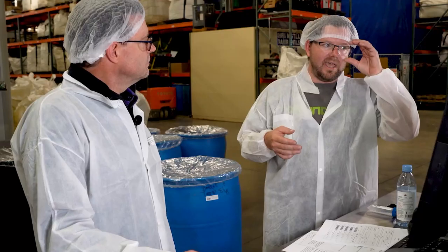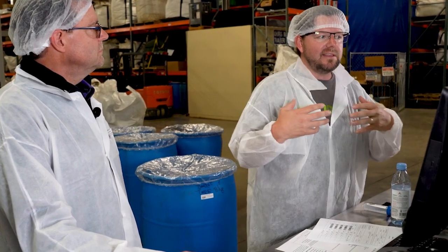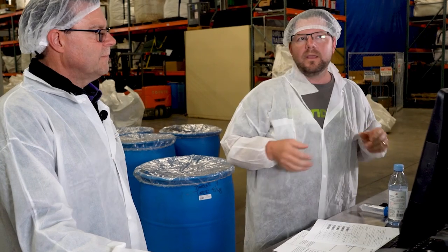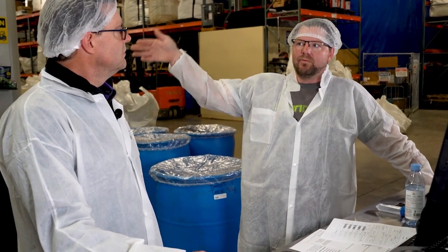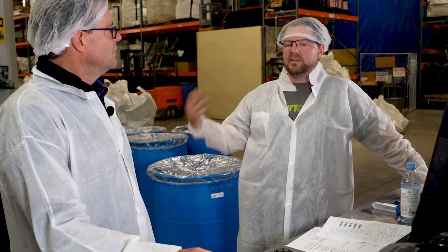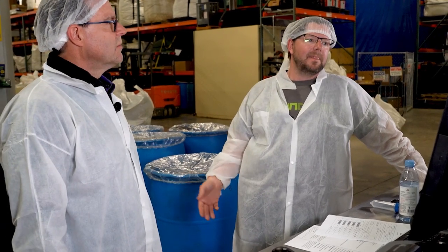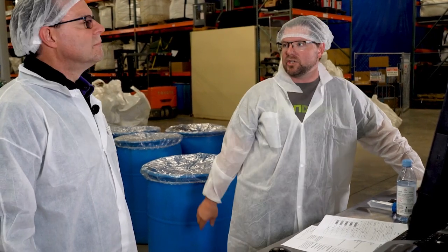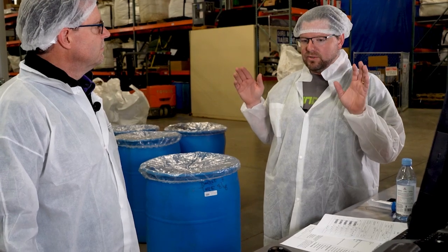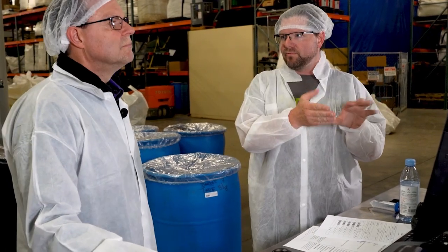A lot of people ask us, can you put the data directly from the analytical instrument into IGW? And we didn't feel the need to do that because that's what the data system is for the HPLC. It's there, it's got all the data integrity items in it. A lot of people are worried about data integrity, and it's going to put out a report. That report should be signed by the analyst and then attached here. Got it. We didn't get into all the details related to actually taking the bits that are coming off the HPLC and putting them into the system. It's not what the system is for.